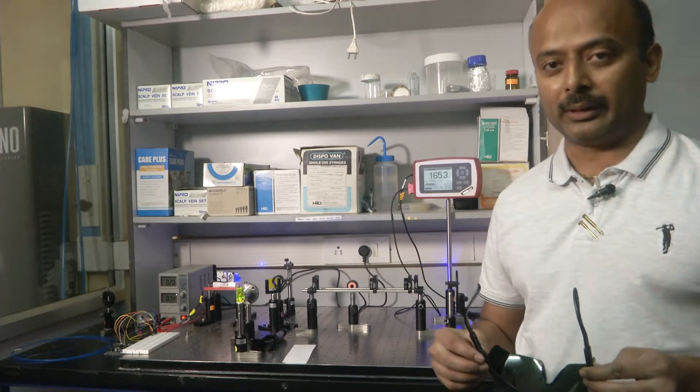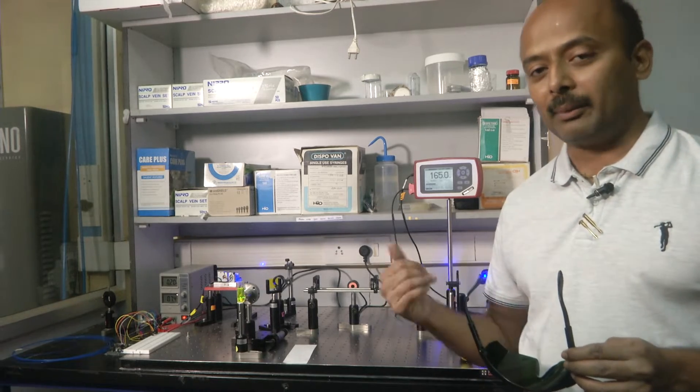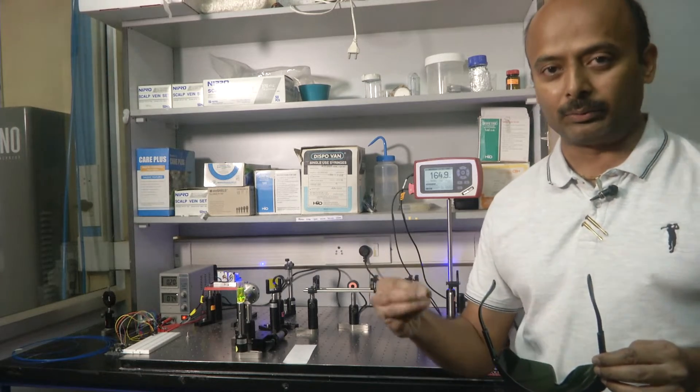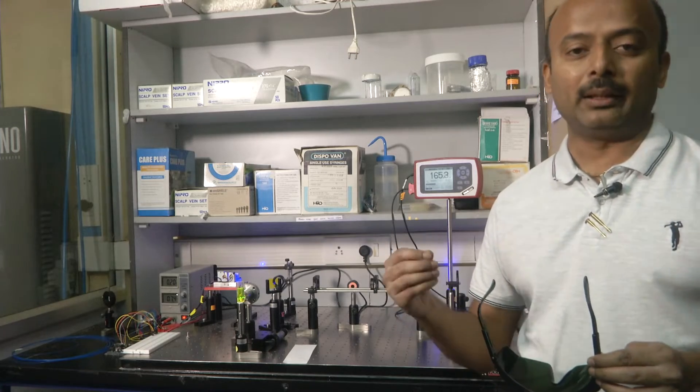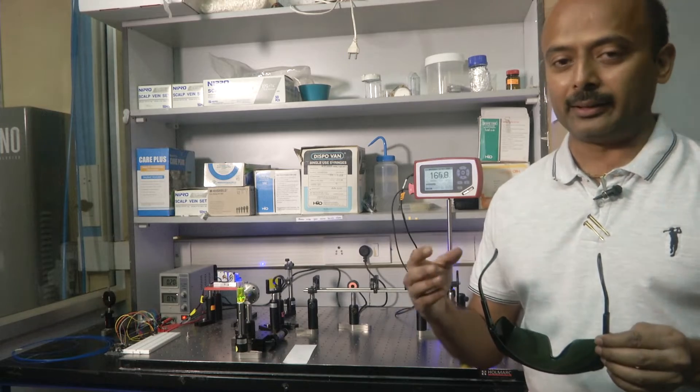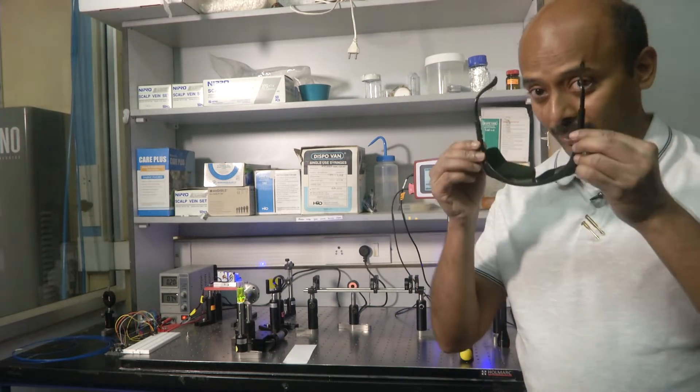Now during that time I had actually told you that we would replace that fiber optic with a fluorescent solution with the hope of showing you a small home-built fluorescent spectrometer, a laser-induced fluorescent spectrometer. Let us go ahead and see how we actually do that.